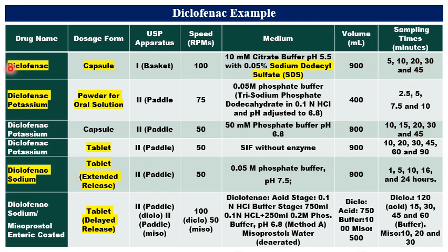Now you can clearly understand this is the base and it has less solubility. That's why sodium lauryl sulfate or sodium dodecyl sulfate might be used. But here the solubility might be increased due to this salt form, and that's why there is no SLS in the medium. So the dissolution is formulation specific, or these conditions are product specific. Then coming to tablet formulation, it also has different media.